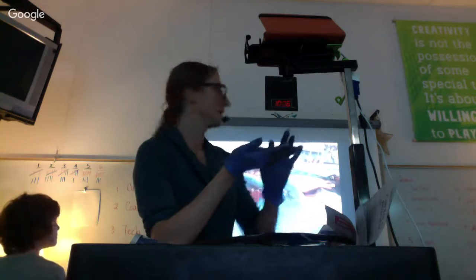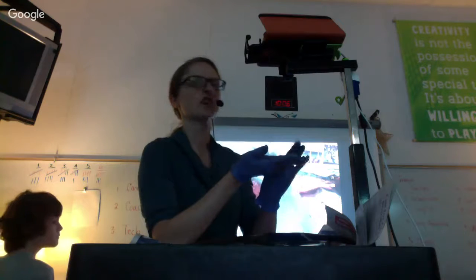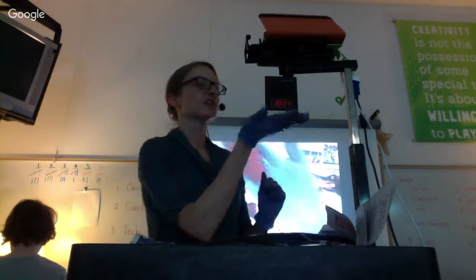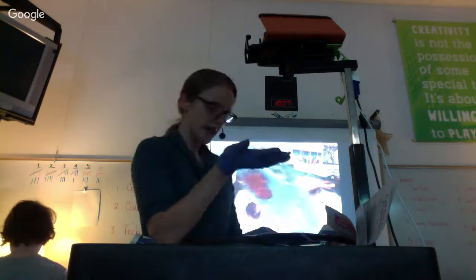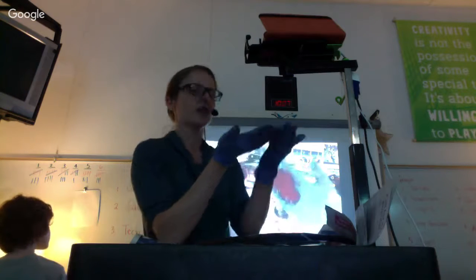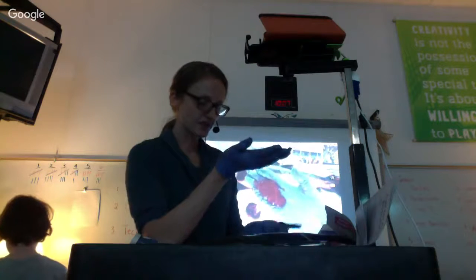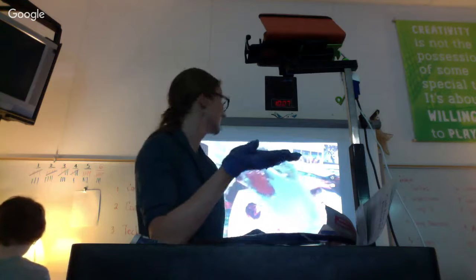Ella, what team are you guys? You guys are the Chinook. So the Chinook is the only girl in the room, which is really interesting. So that's what the eggs would look like. And of course, this is what the milt looks like. So whatever you got, most of us got milt, you're going to put it on your plate. You're going to circle it and put milt, M-I-L-T. Okay?